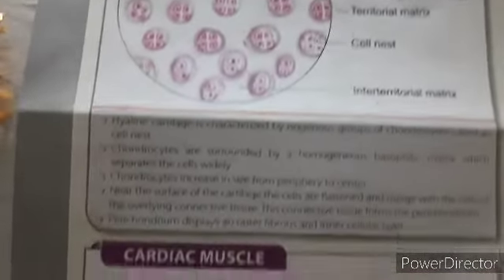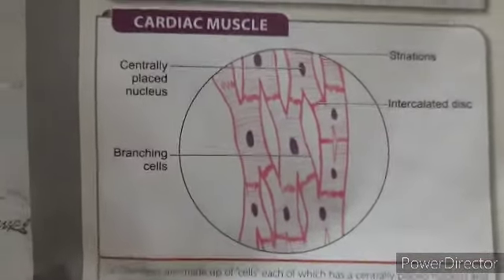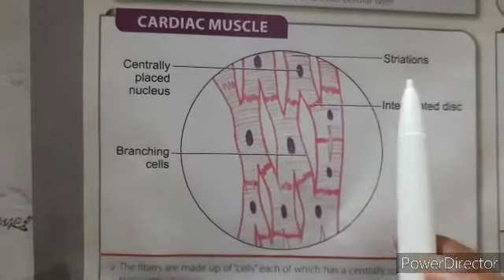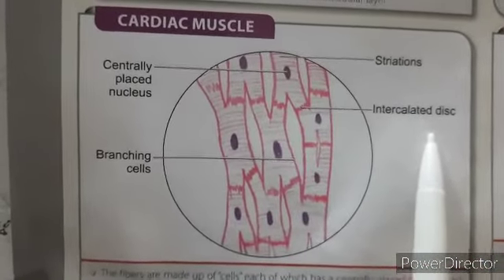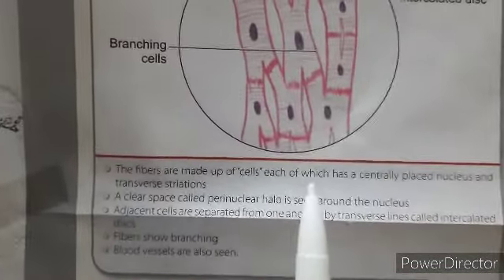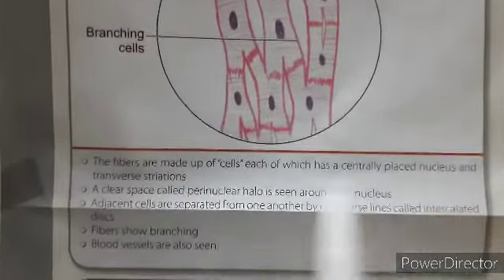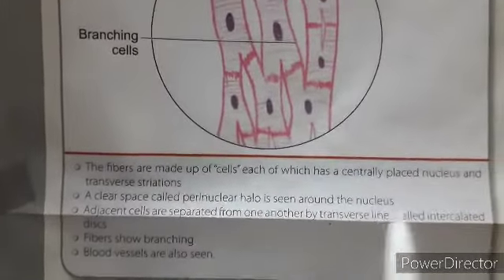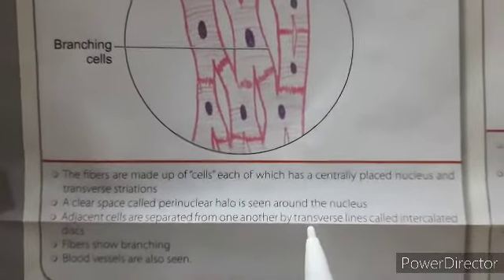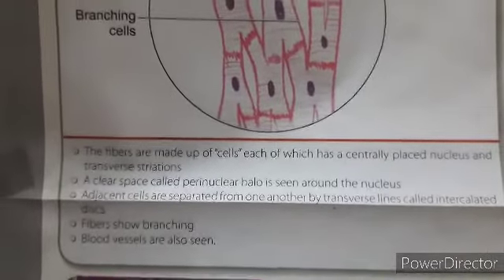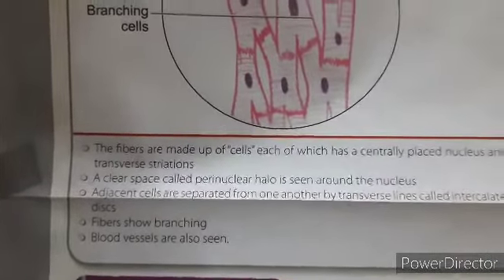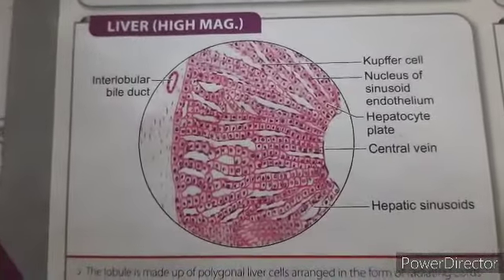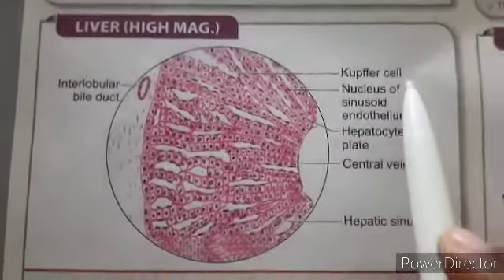Now moving to cardiac muscle. Key features include centrally placed nucleus, striations, intercalated discs for fast conduction, and branching cells. The fibers are made up of cells each having a centrally placed nucleus and transverse striations. A clear space called the perinuclear halo is seen around the nucleus. Adjacent cells are separated by transverse lines called intercalated discs. Branching blood vessels are also seen.